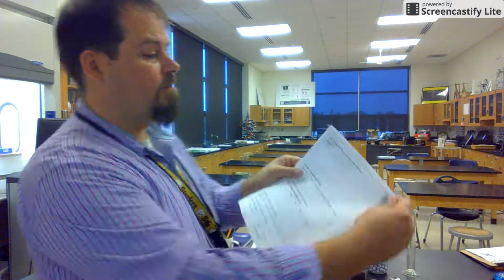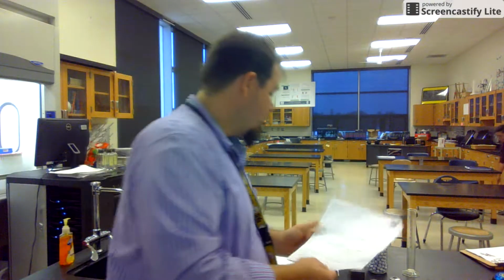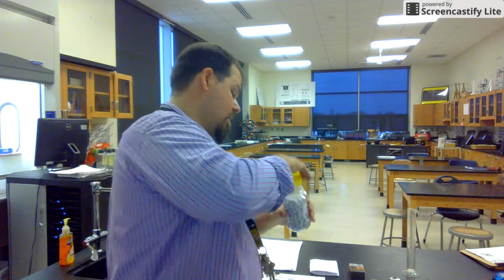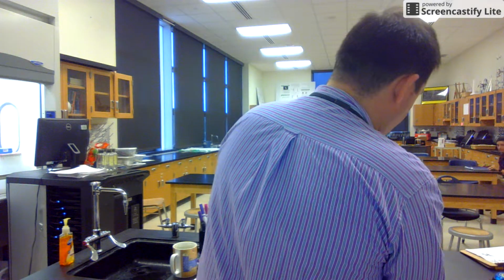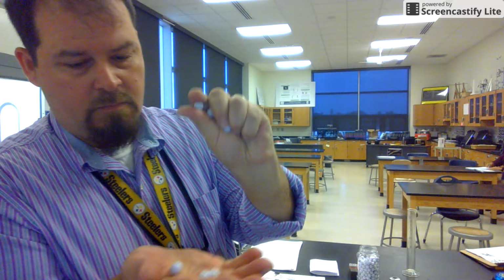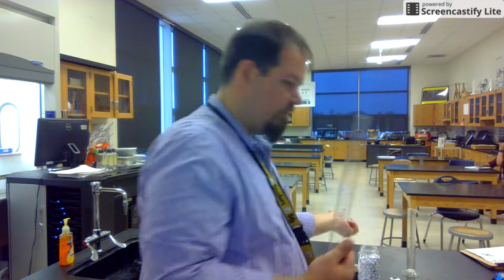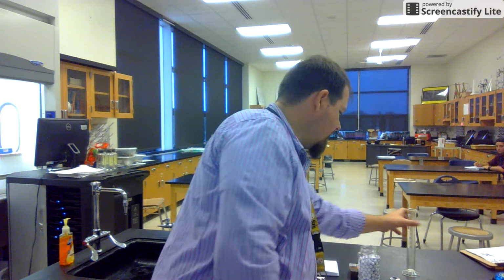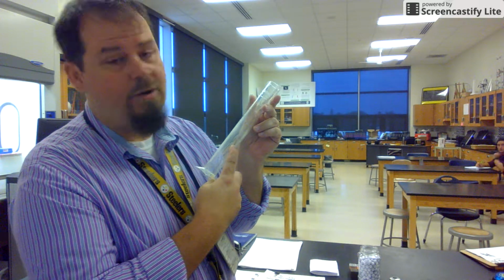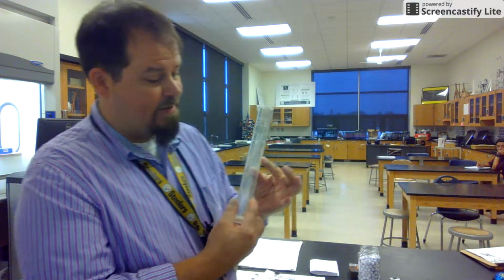Now, part 2. Procedure for finding the density of the irregularly shaped objects. We are going to use marbles of some sort. I don't even know what kind of marbles these are, but they're marbles. They are round spheres, right? See them? Round spheres. We cannot just use a ruler to figure out their volume. So we are going to measure by displacement. You're going to have some volume of water in here. Make note of what your volume of water is. You're going to add 5 marbles in and find the displacement.